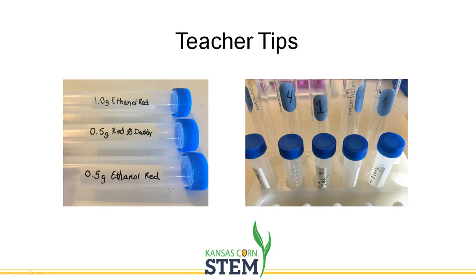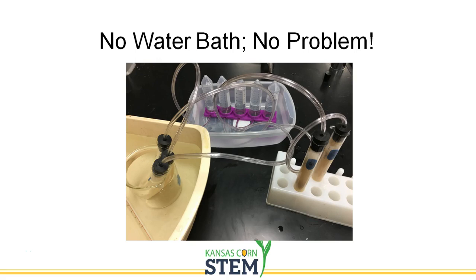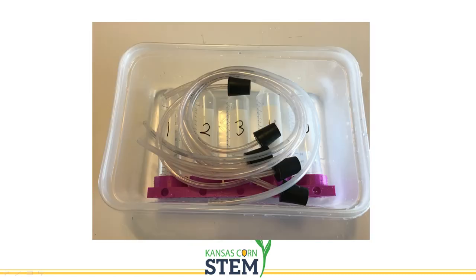At the workshop, we used water baths to control the temperature. I know water baths will be limited in your lab if you have one at all. In the picture, you can see a setup that we used to control the temperature without using a water bath. Students added warm water to the tub on the left. When their water cooled off, they simply scooped some out and added some more hot water. They kept their temperature range between 38 and 40 degrees. The 2 test tubes on the right were room temperature. When finished with the lab, I have students run water through the tubing and then store everything in their Ziploc tubs so the lab will be ready to set up the next time I want to do it.